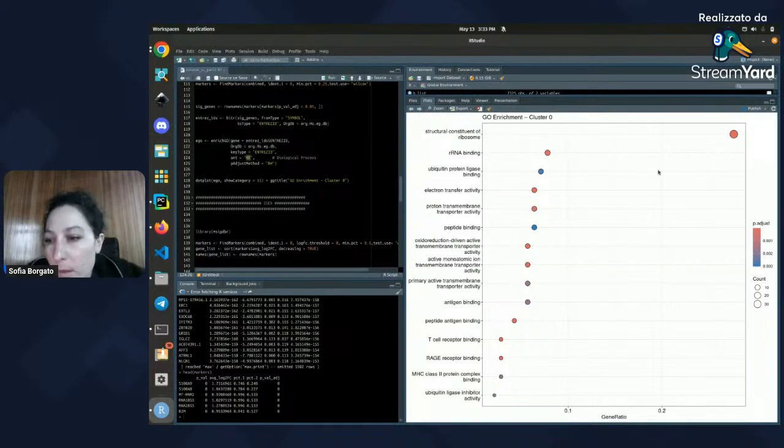And in this case, the analysis was quite good because we have both positive and more not so good enrichment.